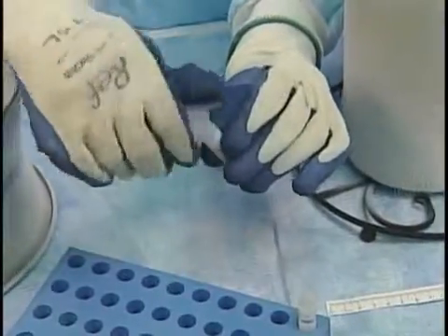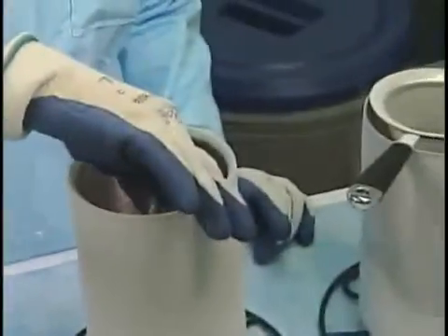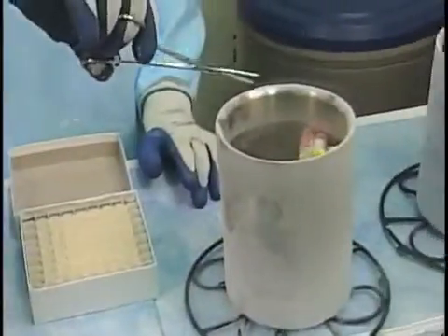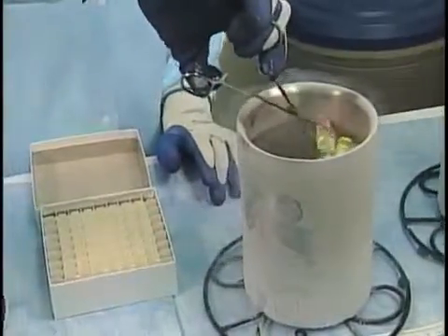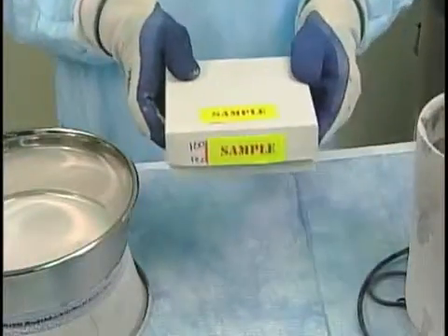One of the liquid nitrogen canisters can be used as temporary storage until all samples are frozen. When done, transfer the cryovials to long-term liquid nitrogen storage. At such low temperatures, these droplets may be stored for years.